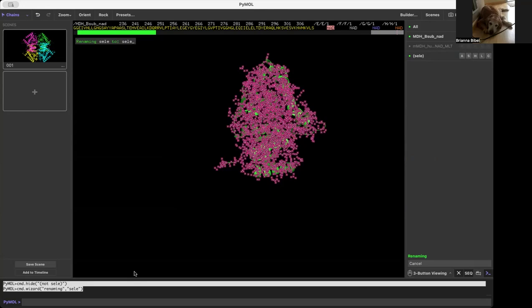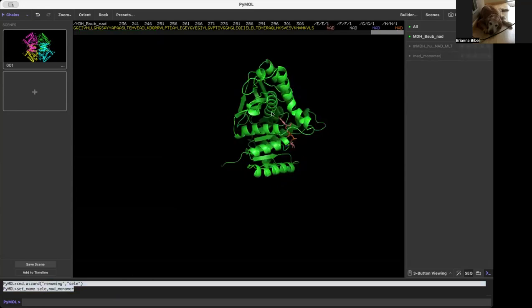So if you do it in this manual way, just backspace — I'm going to name this NAD Monomer — and voila! I've saved my selection.